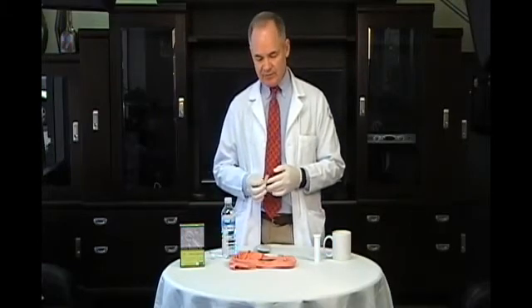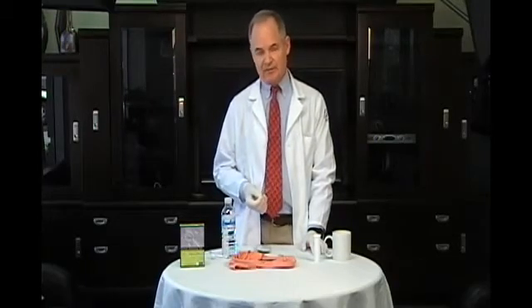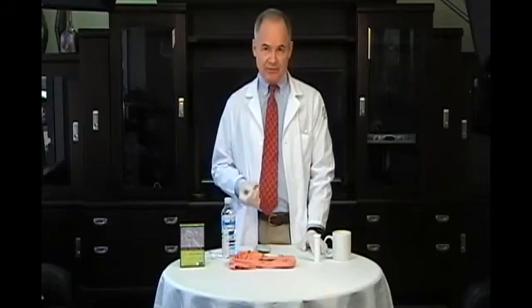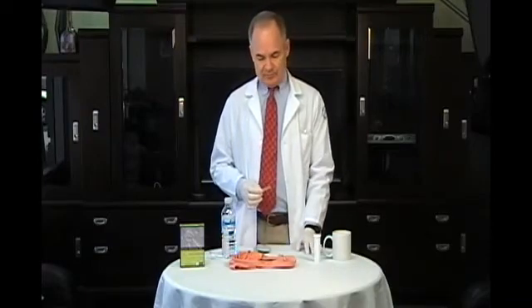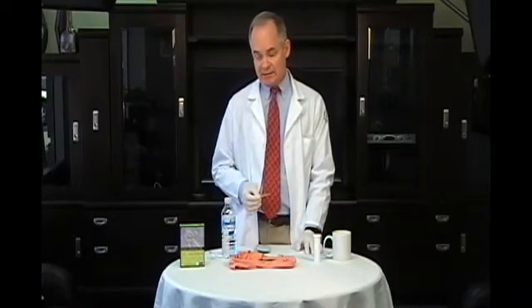When this test strip comes into contact with semen, the acid phosphatase in the semen catalyzes the hydrolysis of the naphthyl phosphate to naphthyl alcohol, which then immediately reacts with the diazonium salt to form an intensely colored blue dyestuff. Hence, a positive test would be dark blue or purple. Now, the procedure is to place the test strip on the stain for about 5 seconds, pull it off, and read it within 60 seconds.